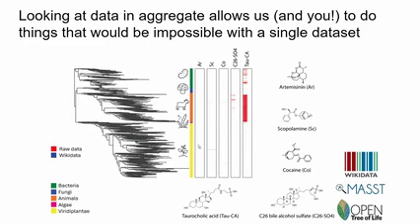You can see that we have hits at very specific places, and you can make cool findings like that by integrating, in this case, taxonomy with MS-MS matching, or metabolomics data more specifically. Like here, for example, artemisinin, that's a malaria drug, and we find it in some specific plant, or like cocaine.